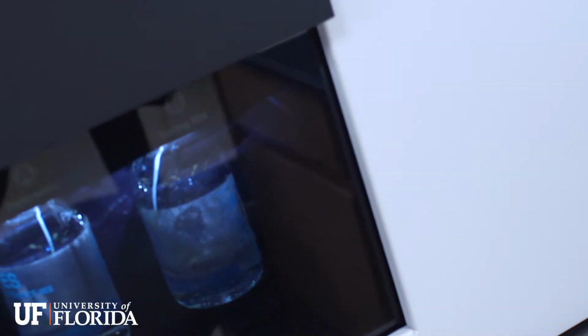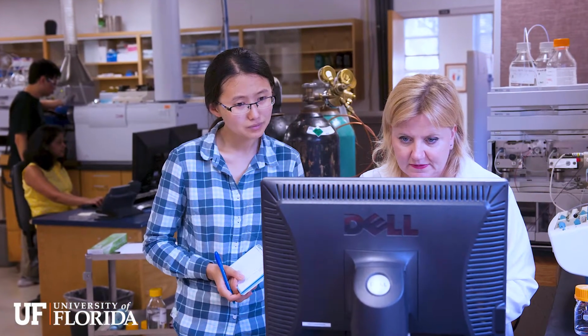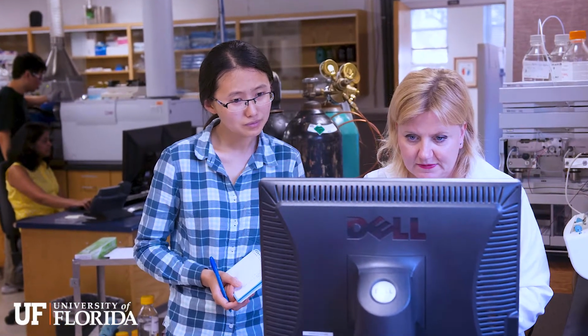This instrument here is an Agilent time of flight instrument. It doesn't have MSMS capabilities, and its resolution is what we call medium resolution. It's a resolution of about 11 or 12,000. It's still high enough that this is the instrument that we use to do all the accurate mass analysis, predominantly from the synthetic chemists that have made their product, and they need to validate that their product is actually what they made. We have an LC in front of it in case people want to do LCMS.